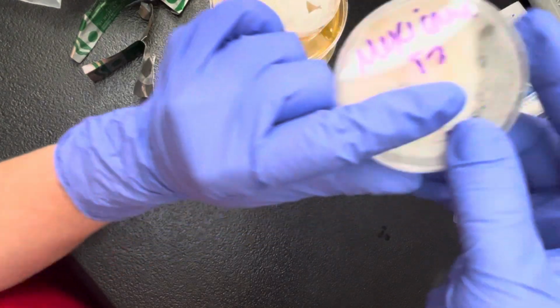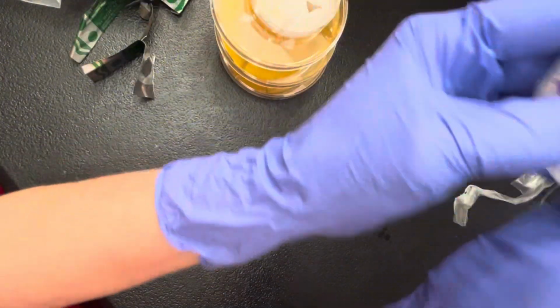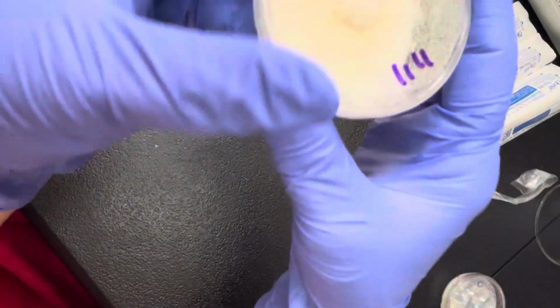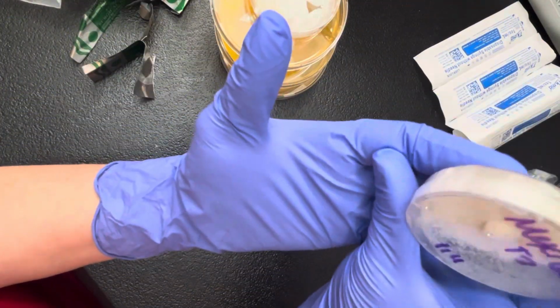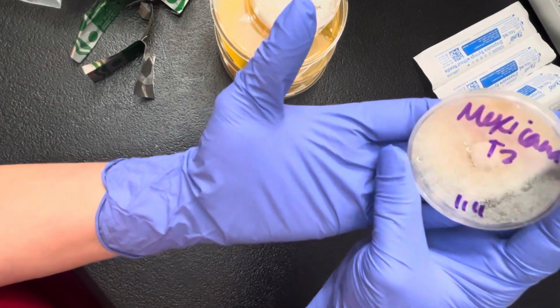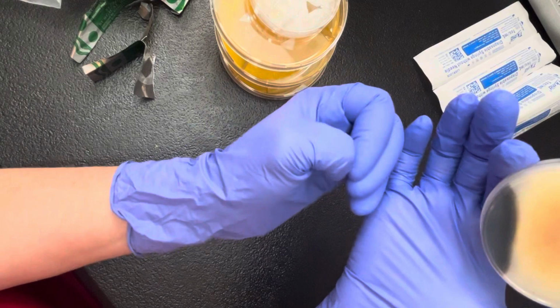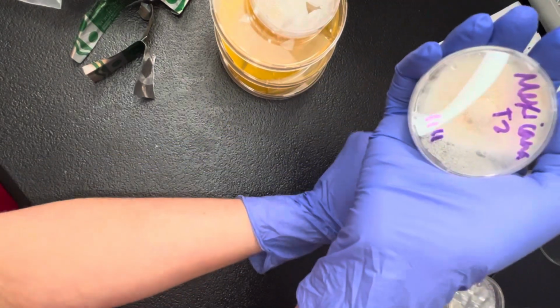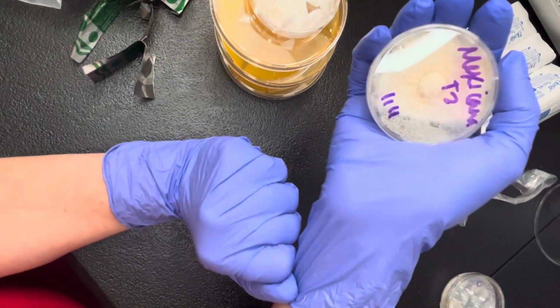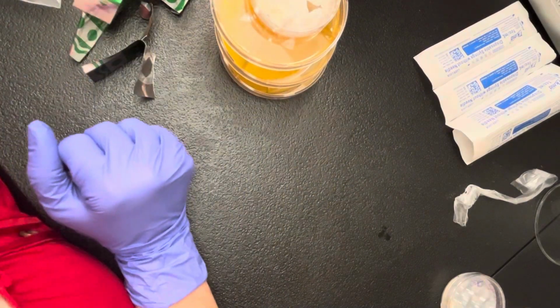So you can see in the front here that the mycelium is covering this. Oh, it's getting a little foggy. Well, now I just made it worse. The mycelium is starting to cover the contamination. And so I have an option here. I can open it. It's probably going to be aggressively contaminated, but I could get a good transfer off of it. But at this point, I started from spore on this one, so I'm actually going to skip this one because it's just not worth it to me to get an aggressive type of mold in my house, if that makes sense.